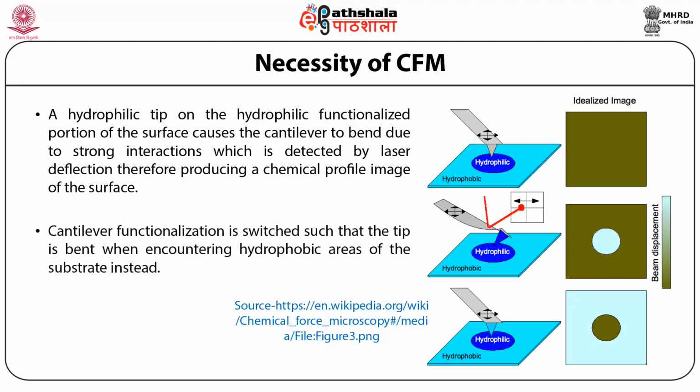Cantilever functionalization can be switched so that the tip is bent when encountering hydrophobic areas of the substrate instead. This phenomenon is explained in the picture given below, wherein hydrophobic and hydrophilic attractions between the two plates have been indicated.